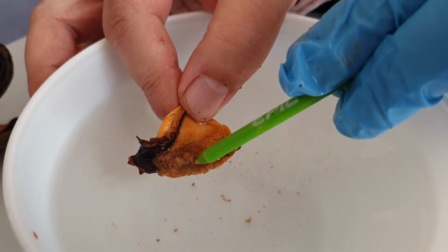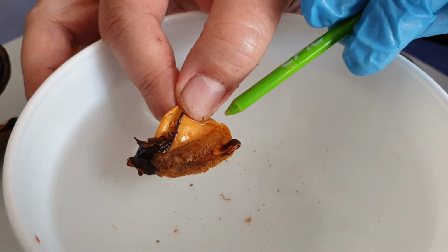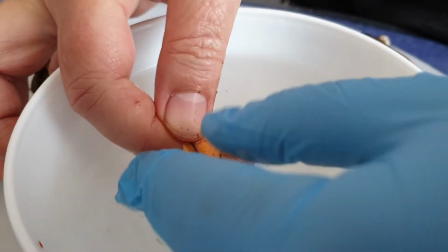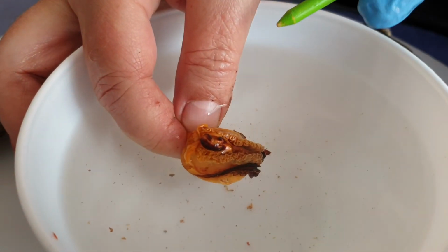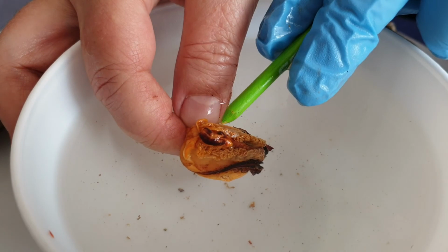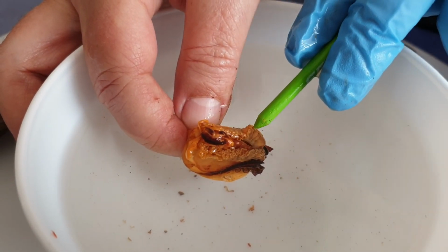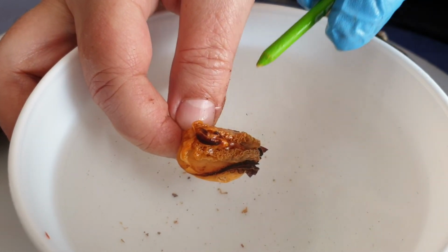This is one, and this is a second. I don't know if you distinguish, there are many, more than one in this side. And if I turn to the other side, the same. They are like sheets of a book. They are many, and they are used to breathe, to take oxygen from the water.